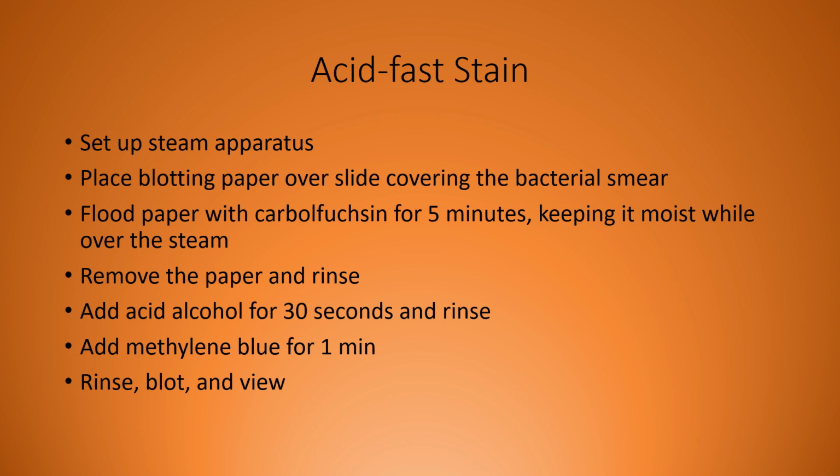So usually we set up a hot plate, we put a beaker on it that has water in it, and then you put something across the top of the beaker that you'll be able to place your slide on. And so you're going to take your slide, smear your bacteria on it, you can heat fix it, and then on top of this apparatus to hold your slide, you're going to place your slide, you get the water boiling, or almost boiling, so the steam is coming up to the slide.